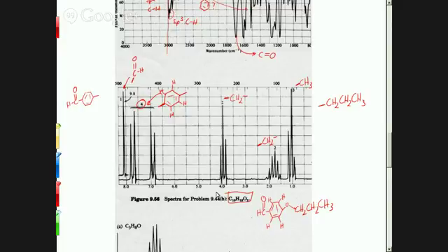Yeah, I got 7 neighbors by 4. Right. So as I said, in an aromatic region like that, you can't calculate the neighbors because the splitting is not clear enough, so everything's all split. All you can get from this information is that it's an aromatic group with 4 hydrogens. So that's one of your pieces. An aromatic ring with 4 hydrogens on it, which means it's connecting to 2 spots.